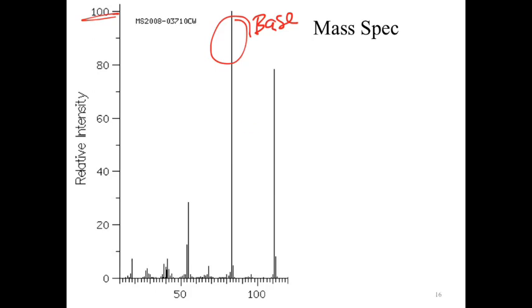Okay, we could look at the difference between the base peak and our molecular ion peak, and what you'll see is that difference is the matter of a carbon and an oxygen. Turns out we could eject from the molecule carbon monoxide. Carbon monoxide, being an exceptionally stable structure, breaks off on its own, and that explains why we see this shift, or why we see that base peak showing up there. Okay, so what we're looking at is the fragmentation of the molecule. So it's finding the car tire, after the fact.